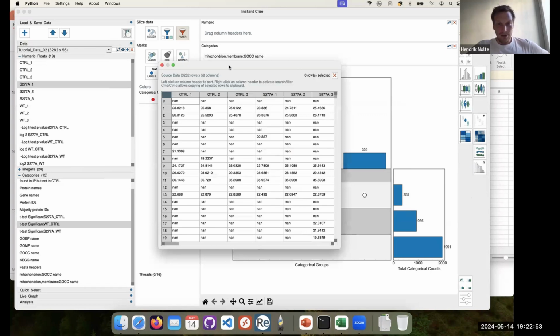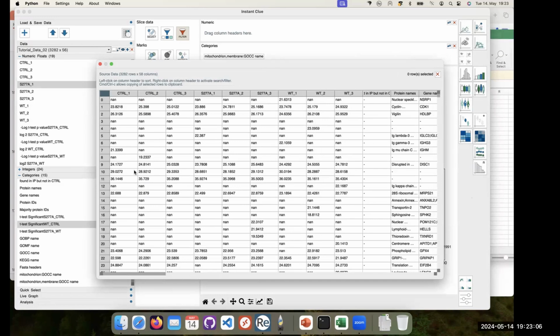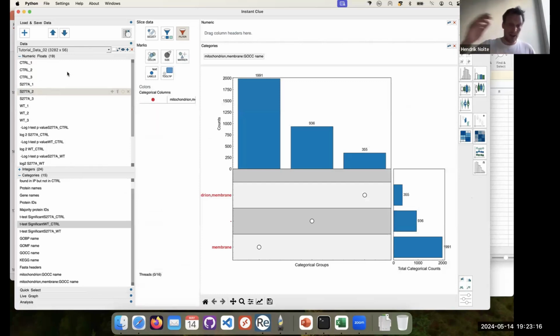And lastly, there is another convenient way to filter data. Really the last one. There was this other option: N largest and N smallest. What does that do? So basically it picks, if you now enter 10, then it would pick the 10 highest or smallest, if you put smallest or largest. So you know the top 20, or top 100 or so, you can subset with that.